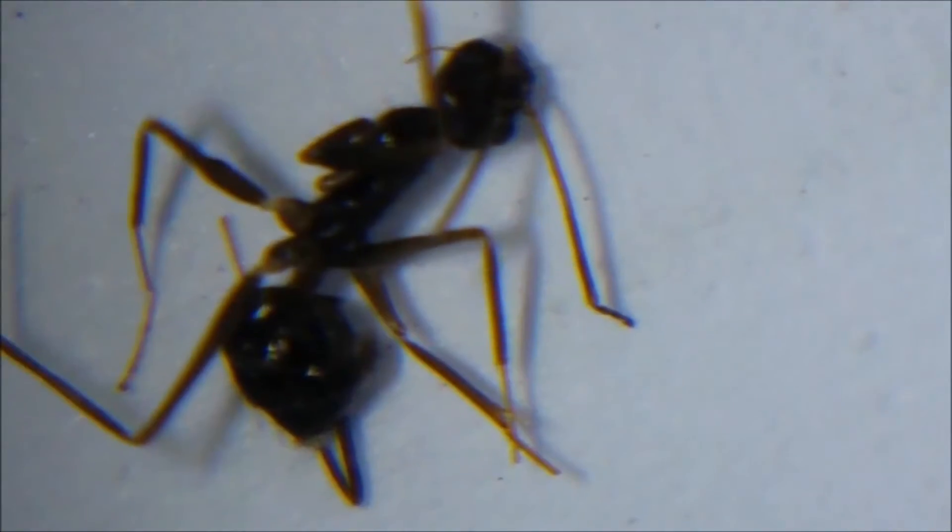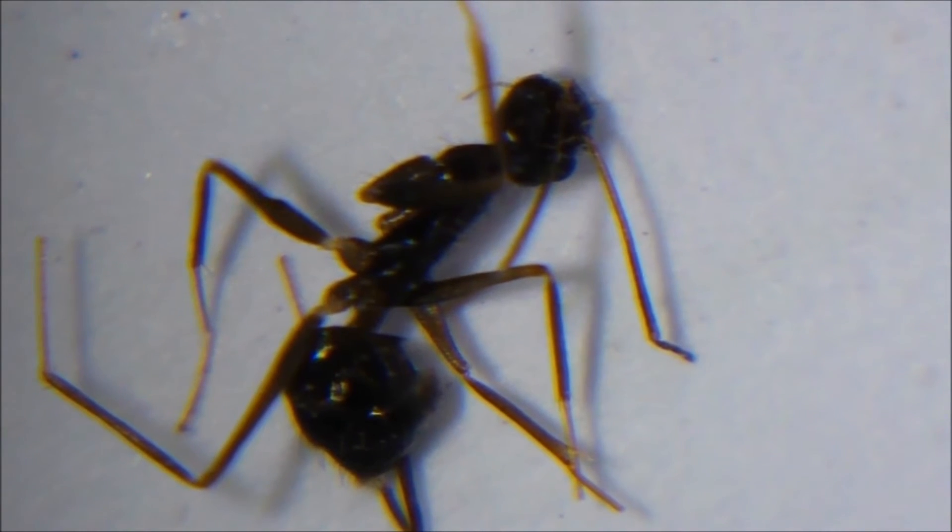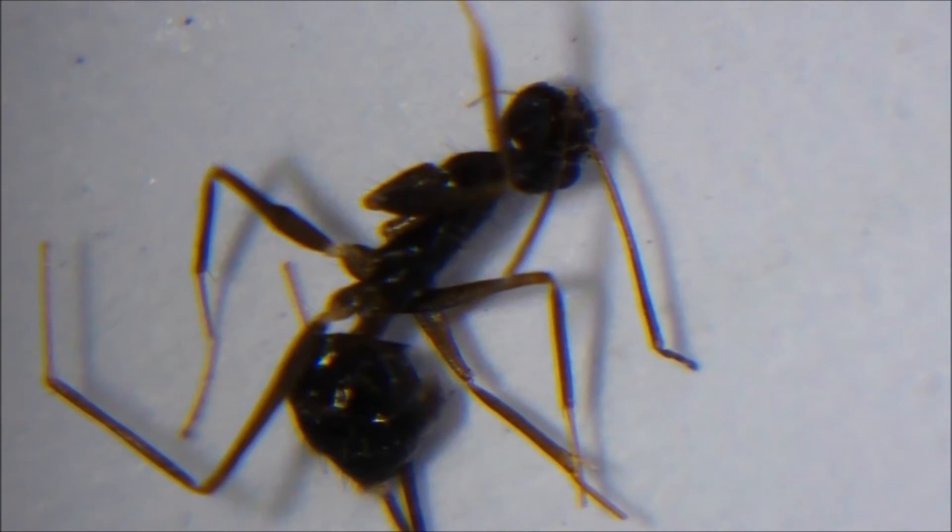Putting my lens right on top of the ant and actually resting it so it gets a good steady view. That's pretty cool. So you see even though I'm covering the lens I still have light because it has a built-in light. It's like I need to use some hand softener. Oh there's a vein — that's gross. Check it out.